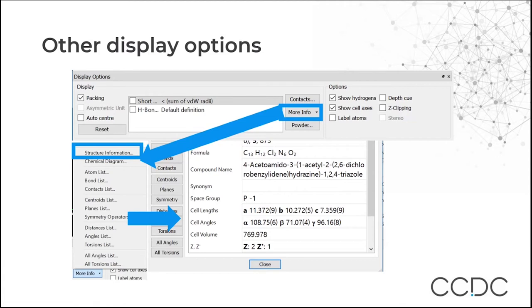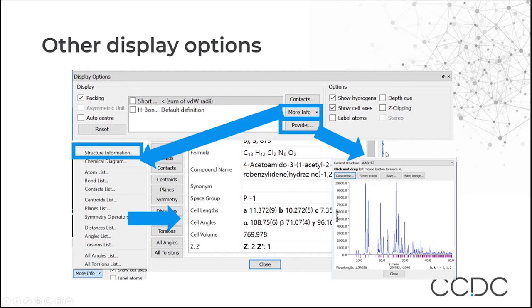If you want to find more information about the structure beyond the 3D display, go to the More Info box. Under More Info and Structure Information, you'll see details like compound name, unit cell lengths and space group, along with a number of other options. You can also calculate a powder pattern based on the atomic coordinates in the displayed structure by going to Powder — it calculates a powder pattern which you can then save or customize.